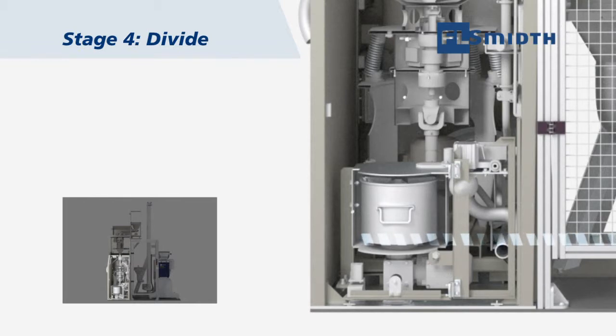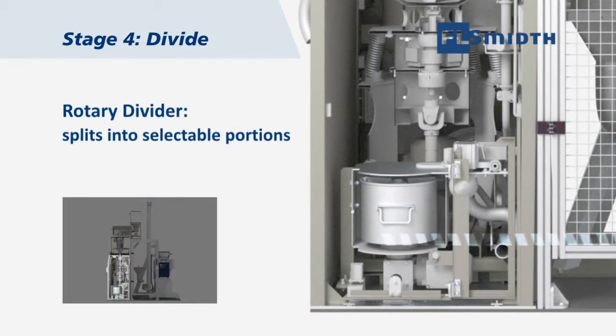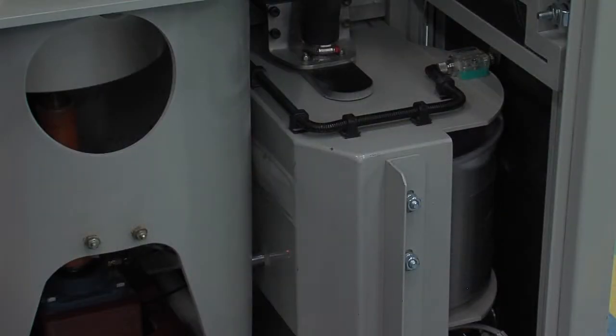The rotary divider splits the sample into selectable portions by placing one or more segments into a standard rotary sample divider.